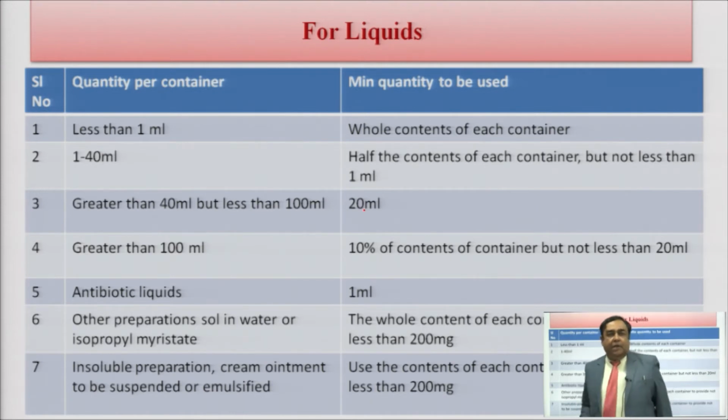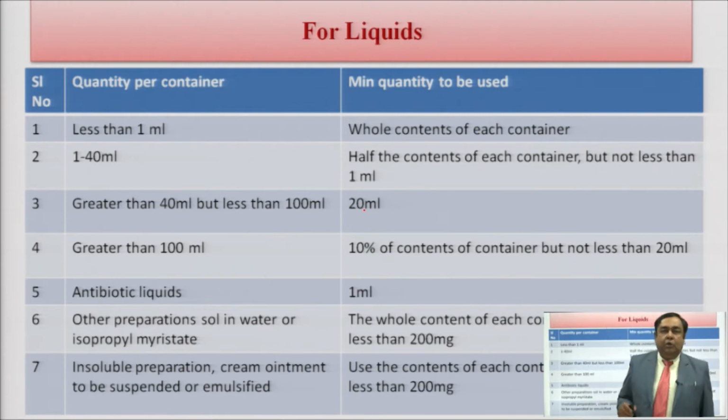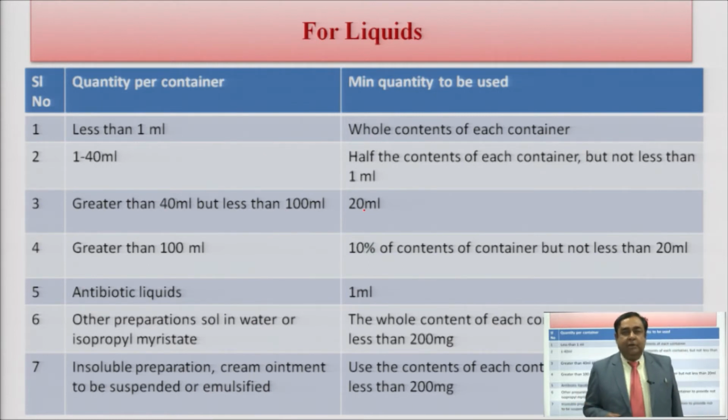If the product has less than 1 ml, you need to add the entire contents of each container. But if your product has a volume of 1 to 40 ml, you have to add half the content of each container, but not less than 1 ml, and preserve the residue.